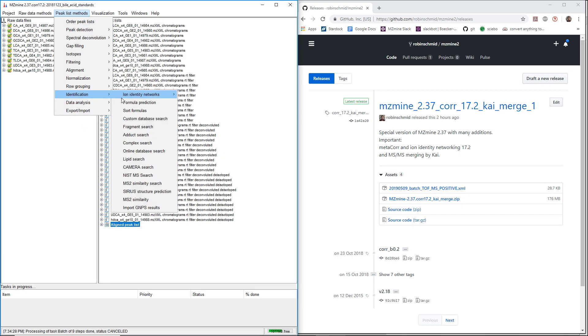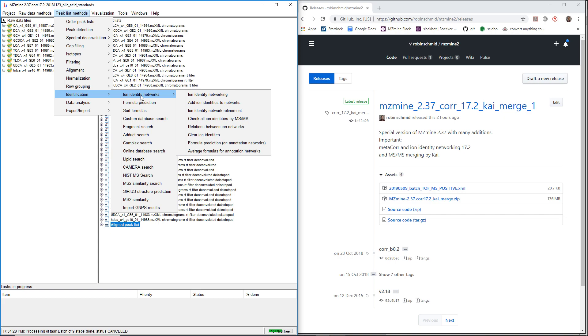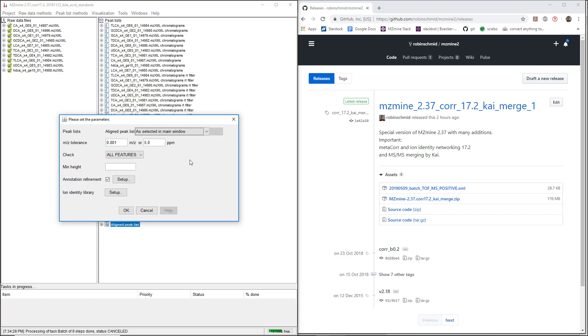Based on this, we apply ion identity networking to find different ions of the same molecule, to find different adducts or in-source fragments, multimers, and so on. The basis is the ion identity networking module.